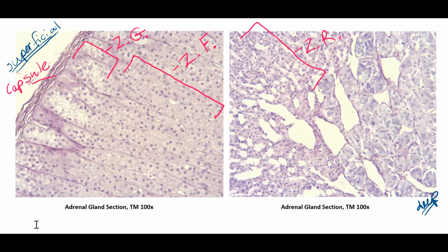And then the deepest part of the adrenal gland is the adrenal medulla. This area, like a few parts of the brain, secretes epinephrine and norepinephrine. And those two chemicals will help create the physical effects related to sympathetic nervous system stimulation.